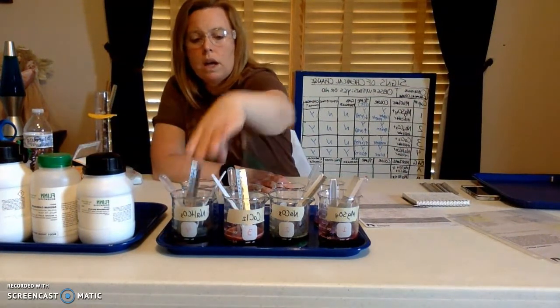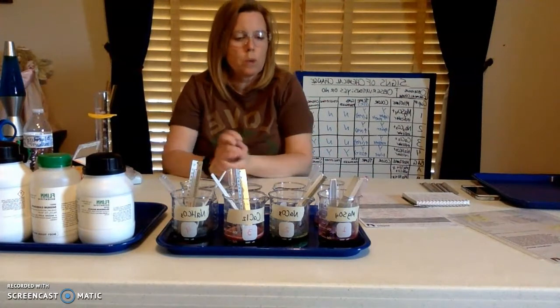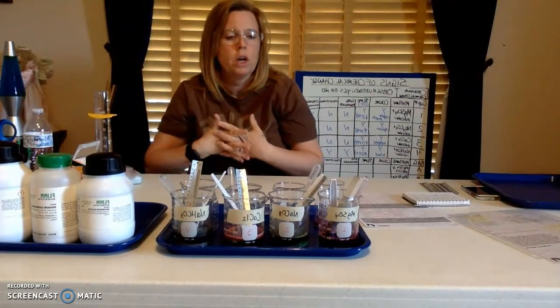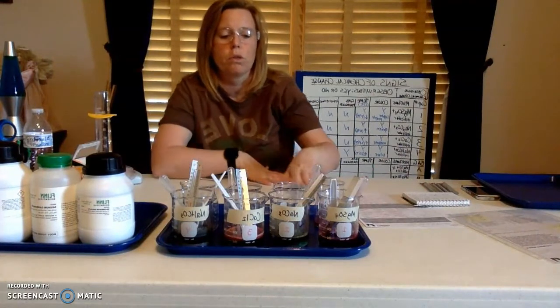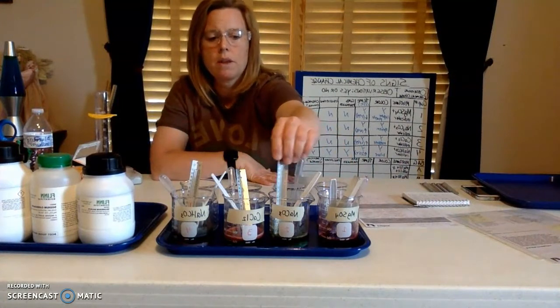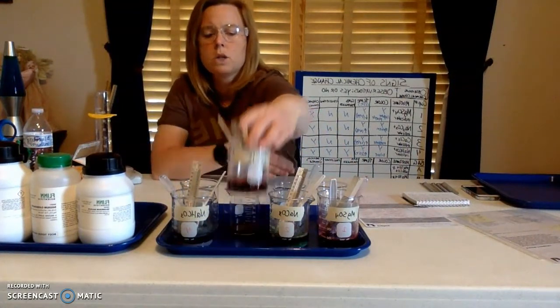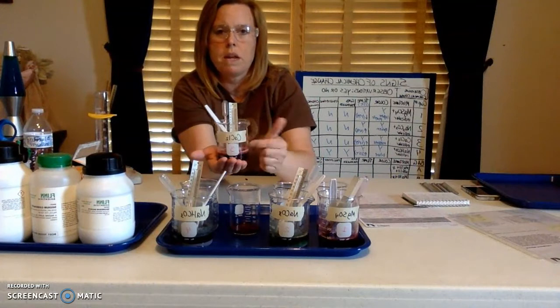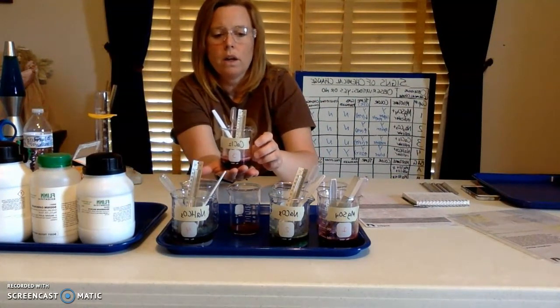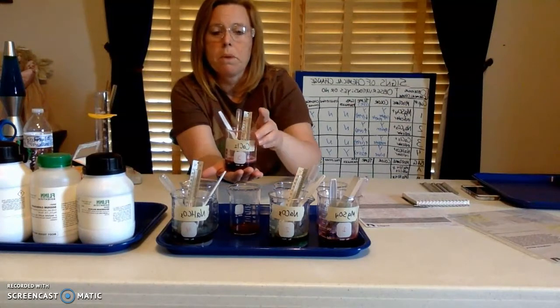All right. Now, some other key characteristics, and you can read this for yourself by opening up my photograph, my picture from my phone once you work through this if you would like, is I have thermometers, and there was a temperature change. Like I said, this one, the calcium chloride, again, this is my indicator, is still warm on the bottom.